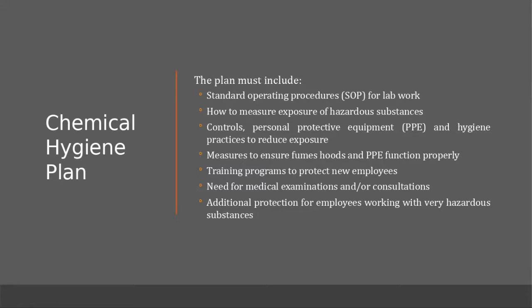Need for any type of medical examinations, consultations as a result of any type of accidental injuries. And then, of course, just any other additional protection if you were working with something that was very hazardous within the lab. But everything is pretty much controlled. Let's say additional protection for employees. You know, we will be using hydrofluoric acid, which is bad stuff. And we'll discuss more on the health hazards that come with hydrofluoric acid. But we do have the proper PPE for handling hydrofluoric acid, where you have to take the extra step to make sure you're safe when using that particular acid.